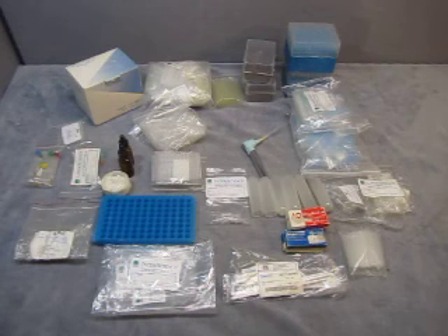For sale we have a large laboratory lot. I'm going to go through everything that's in the lot. There's multiple items so it's going to take a little bit to do.